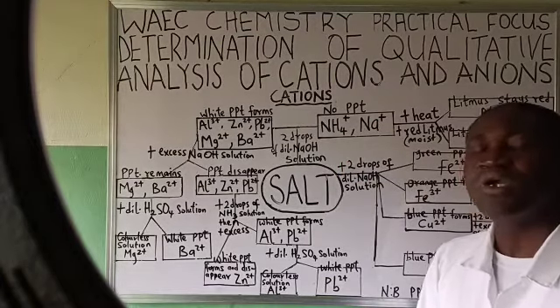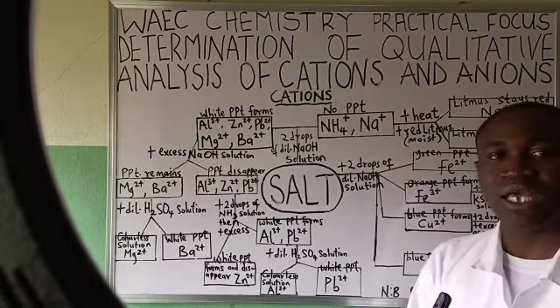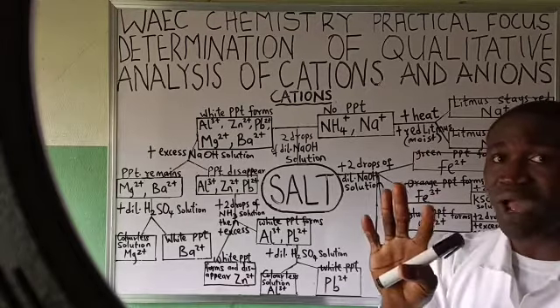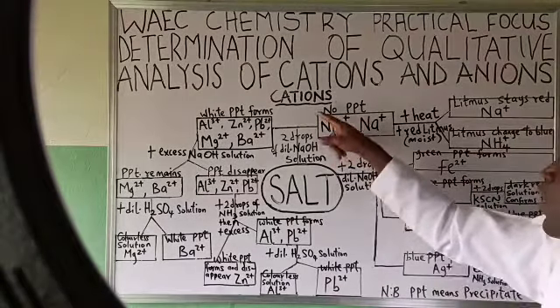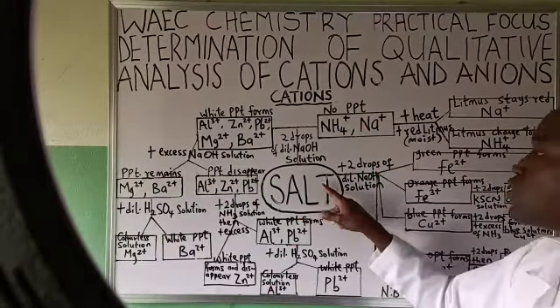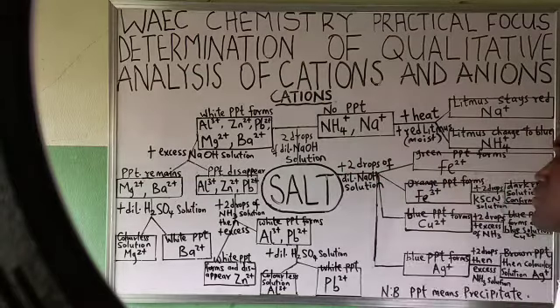Okay? Then when, after heating it, it is not very soluble in water, say that the salt contains... once it's insoluble in water, please pause. I know why I say please pause. Please pause. Okay? Come down to what? Test for cations. Pause. I will still tell you why I say pause. Come down to test for cations. You have left the solubility test, you enter test for cations.